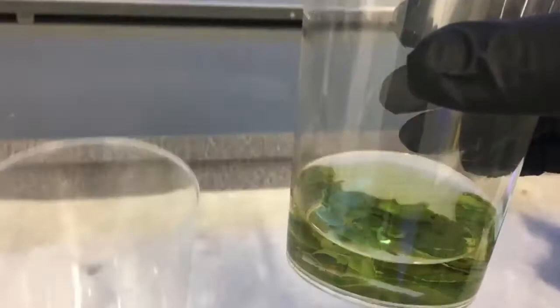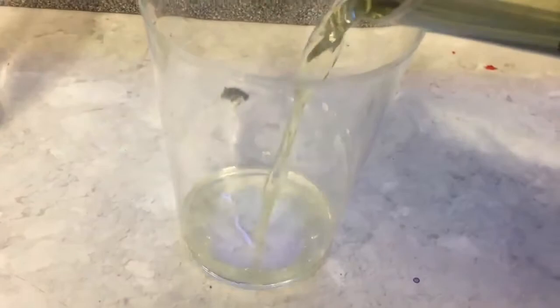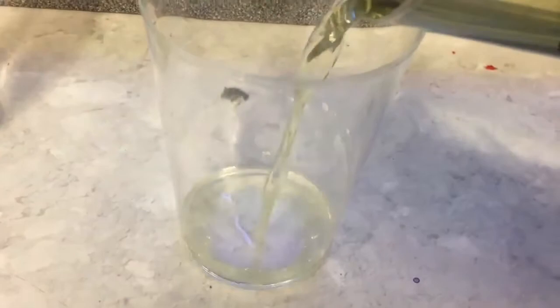Here we have the chlorophyll experiment. All that I've done is broken apart some leaves, placed them in some ethanol, and what that process does is it extracts the chlorophyll into the ethanol. What you should be able to see is once placed under a UV light, that green solution suddenly glows a bright red color. So we can see that the chlorophyll in the ethanol actually fluoresces a red color.